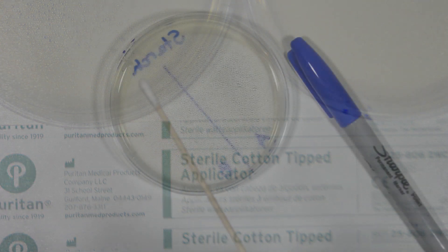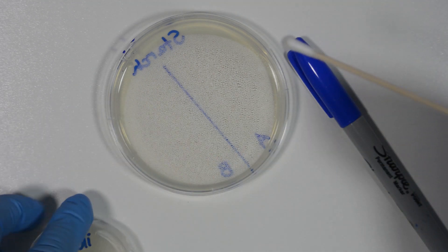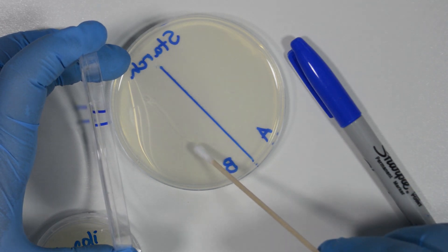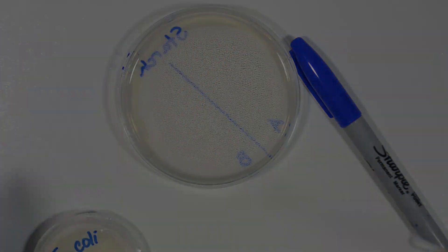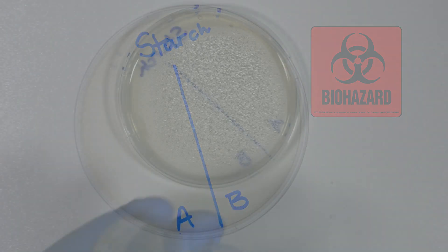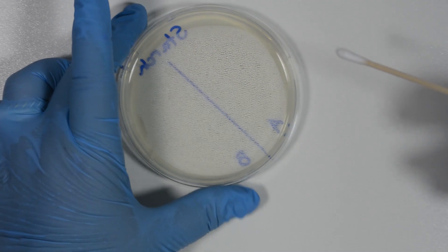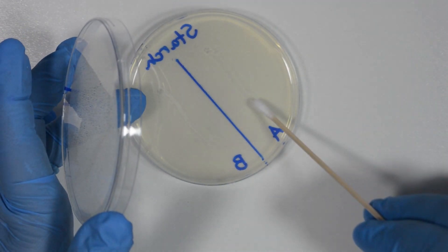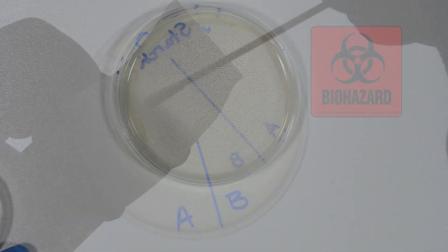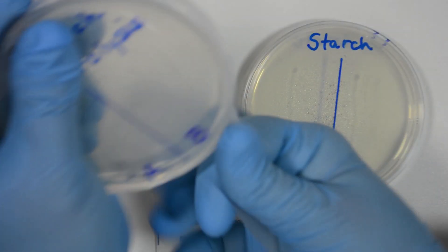This can also be done using sterilized loops. Using a sterilized cotton swab, we pick up a small amount of one bacteria and inoculate it on the medium, making a straight line. Then we dispose of that cotton swab. Using another sterilized cotton swab, we pick up a small amount of the other bacteria and inoculate it on the medium, making a straight line. Then we dispose of that cotton swab. Next, we seal the plates with parafilm.